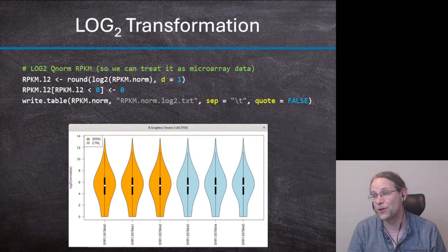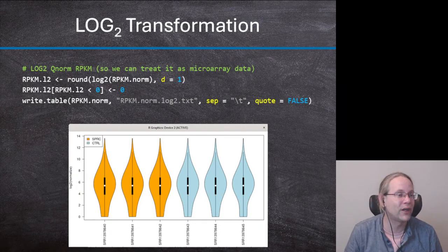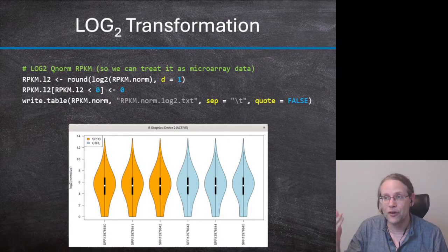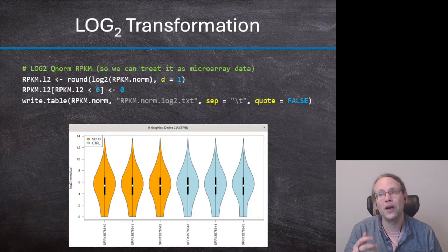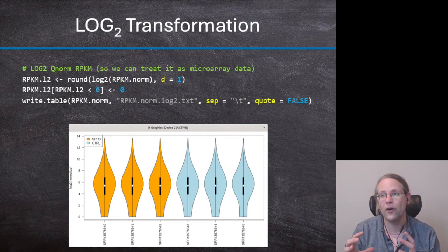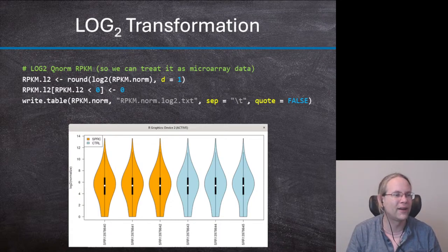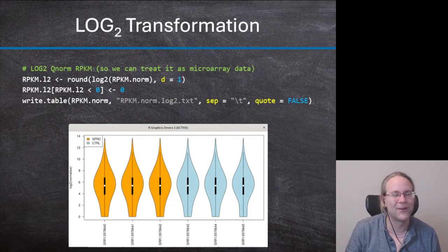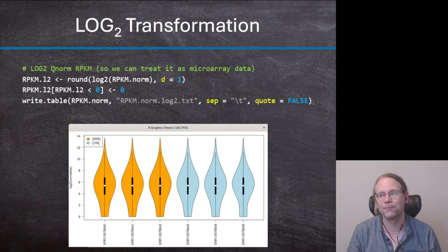But since we're doing it from scratch, we're going to go into excruciating detail on how these things work and how you can compute them yourself, right? Because if you're a bioinformatician, you might want to work on this. You might think, oh, I have a much better idea on how to normalize RNA-Seq data, right? So then you write code which fits into this one step in this massive pipeline. No, don't be sorry. It's good to remind yourself why we're doing it and why we're going step by step.